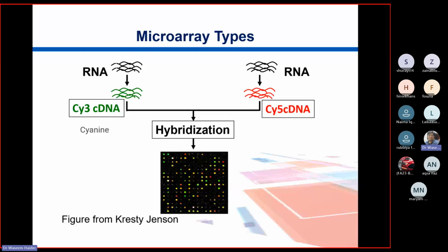The probability of finding the exactly same sequence in another RNA molecule is very rare, or almost zero or negligible, right? So you can estimate what is 1 divided by 4 raised to power 20, right? So that's quite low. It's almost negligible or none. So these probes uniquely identify only the RNA pieces that are complementary to them.